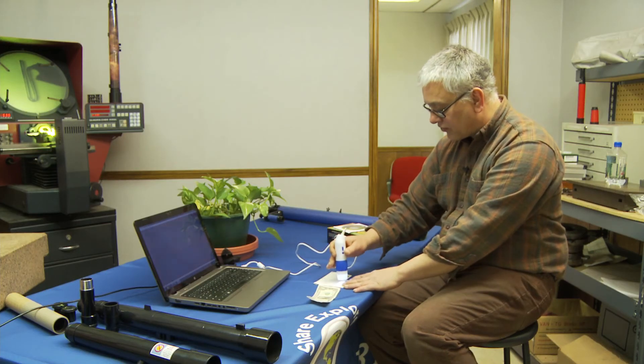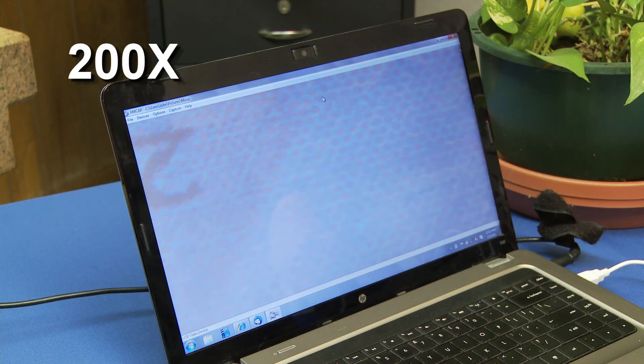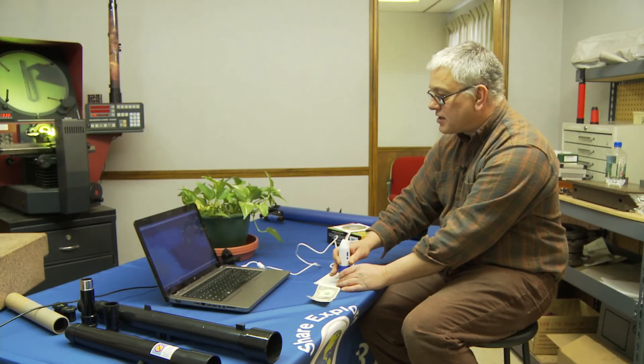I'm going to move this over to the stamp. And now you're actually seeing the pixels in the color of the stamp. You can't really see an object but you're just seeing all the little pixels that create up the color of the stamp. That's pretty, pretty well detailed.